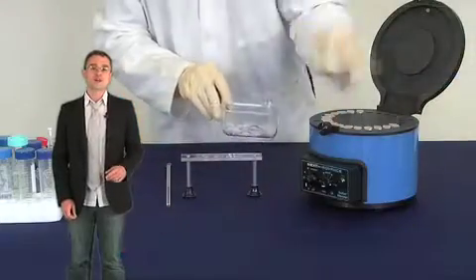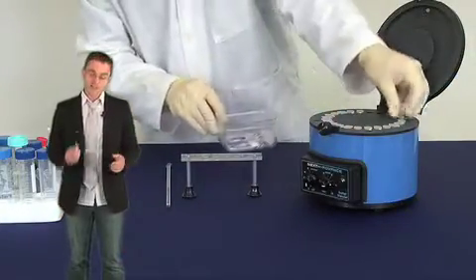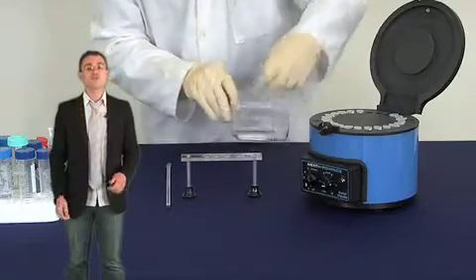Ideal for high throughput processing, you can run up to 24 samples at once in standard microfuge tubes in just 5 minutes or less.